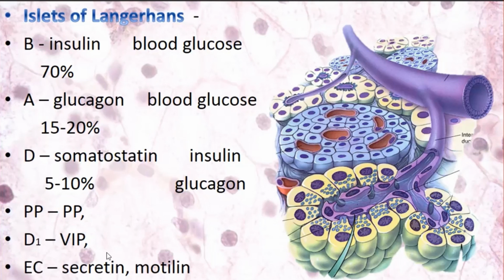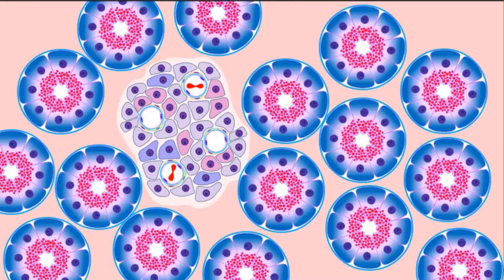Those minor cells regulate functions of the organs of gastrointestinal tract, and especially neighboring organs and tissues. So those cells also are part of the enteroendocrine pancreatic system, and it's represented by islets of Langerhans inside the pancreas.